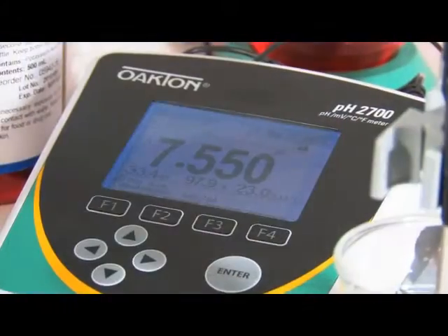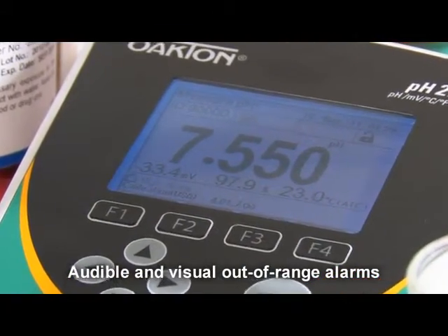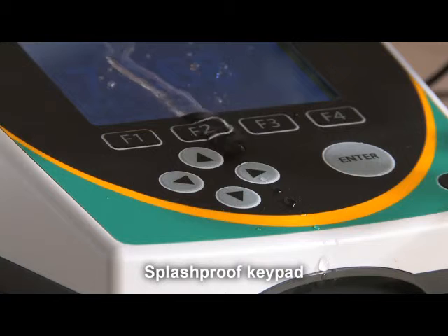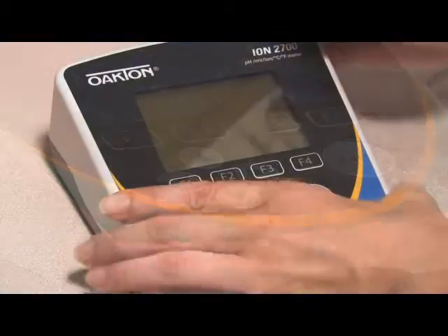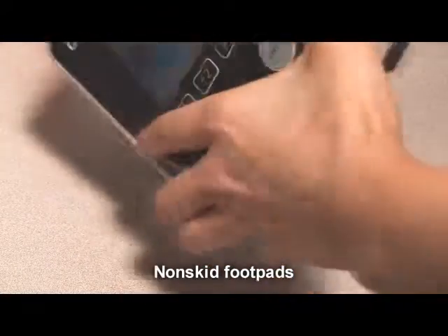Set your 2700 benchtop meter to sound an alarm when a measured value is above or below your specified range. The alarm is both audible and visible. Plus, convenient details add up to value. Don't worry if you spill buffer or water on the meter — a splash-proof keypad protects the meter from damage. The non-skid footpads keep your meter in place without shifting.